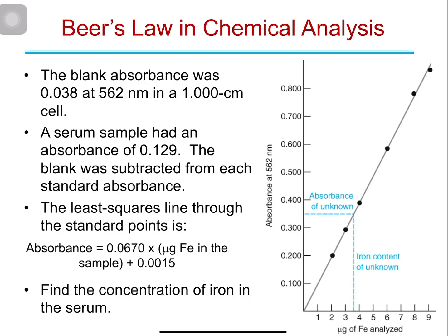In order to measure the concentration of the serum, we need first to establish a calibration curve. And to do the calibration curve, we need a standard solution of iron.